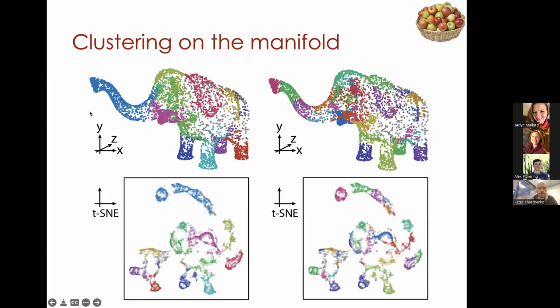There's no inherent mathematical meaning to the resolution of clustering that you're doing, but in terms of interpretation, they can be very different. You might want a coarser interpretation, for instance grouping all the T cells in one group, if that makes sense for the biological story or analysis that you're doing, versus subdividing them into very fine subpopulations if that's what's needed.